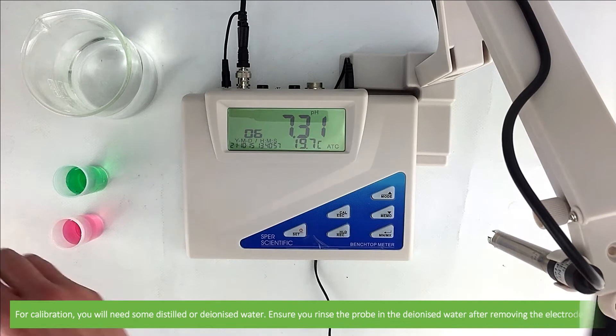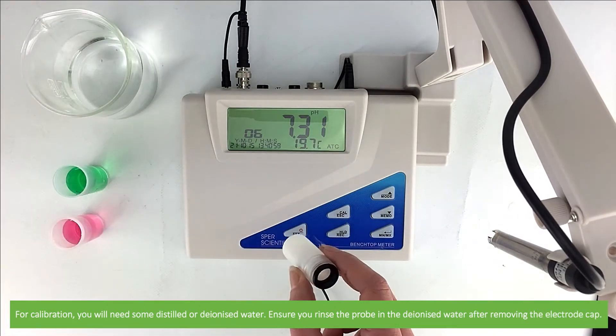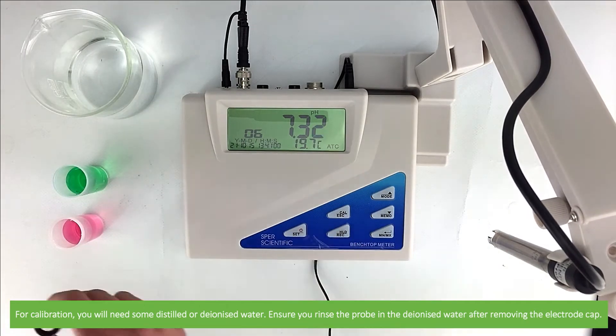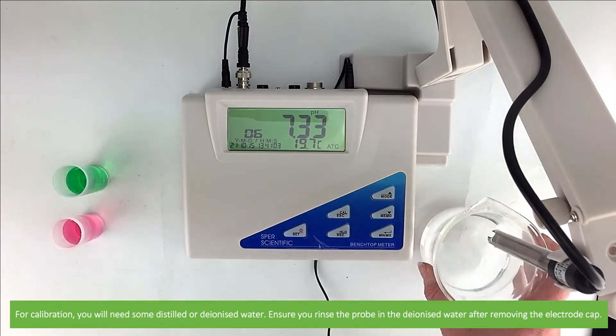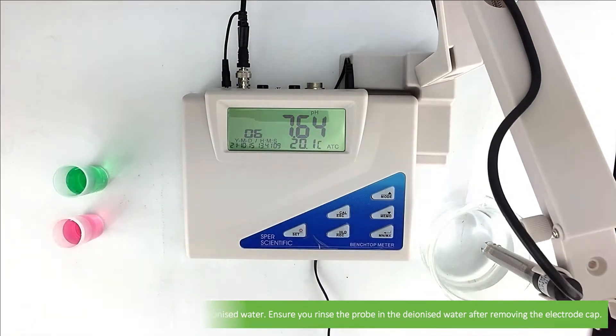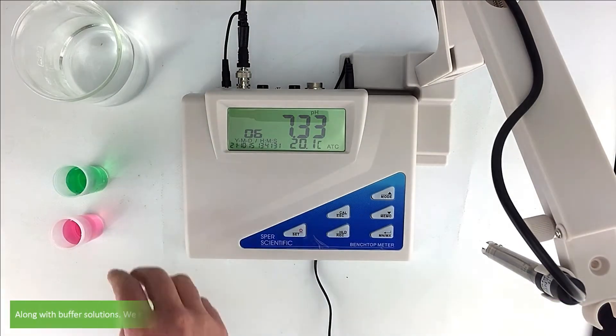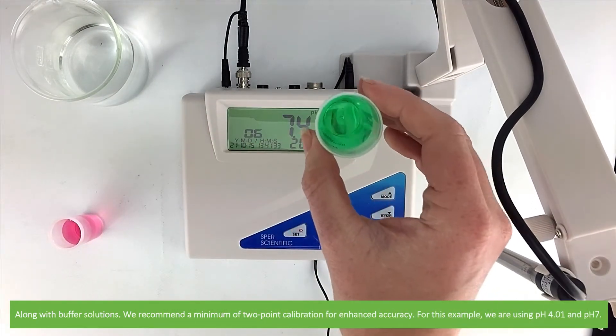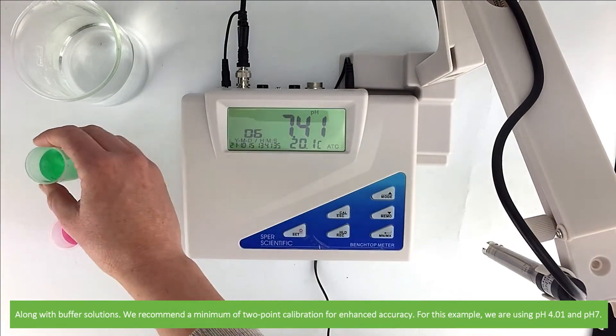For calibration, you'll need some distilled or deionized water. Ensure you rinse the probe in the deionized water after removing the electrode cap, along with buffer solutions. We recommend a minimum of two-point calibration for enhanced accuracy.